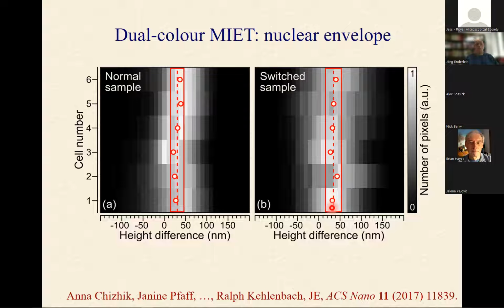This is super important because it tells you indeed that this MIET imaging is a bias-free absolute measurement method. So there is no systematic bias, and we don't need any reference measurements. It's all basically fundamental physics which goes in. That's all that you need.